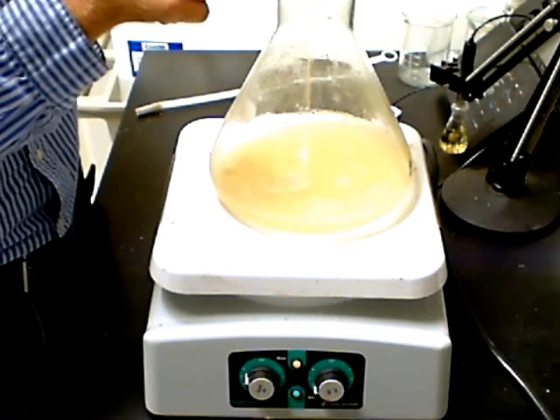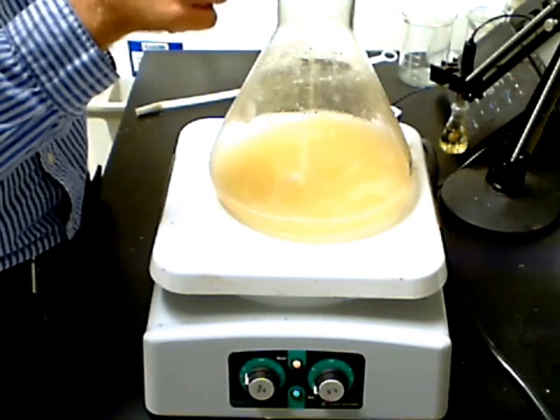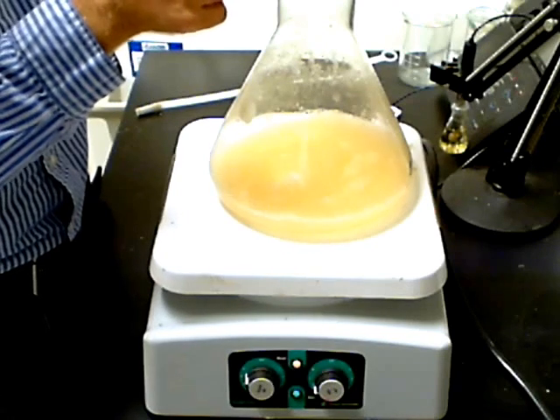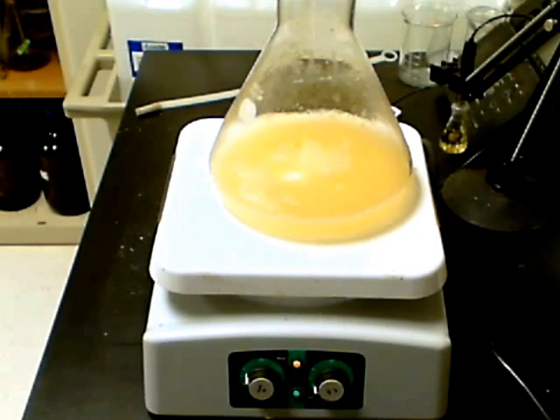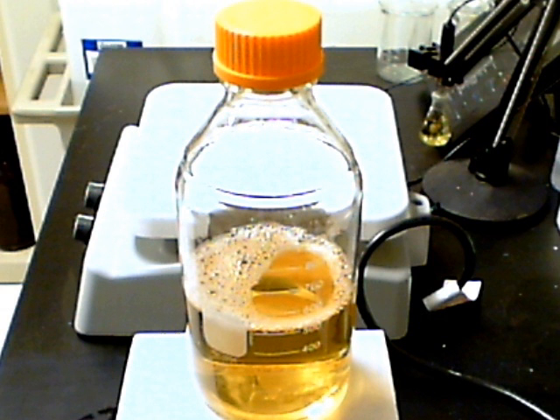Once all of the agar is added, continue stirring and heating until the solution boils for one minute. This could also take five to ten minutes, so again, be patient. You will be able to tell when the agar goes into solution because the solution will turn from a cloudy color to a clear color. Most solutions will have some color — in this case, nutrient agar forms a yellowish color, but you will still be able to see through the liquid.